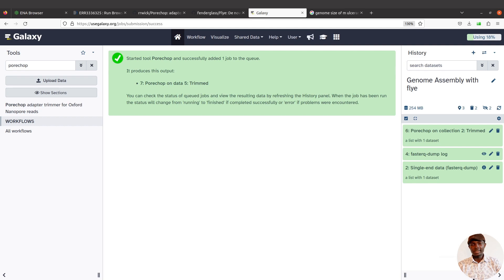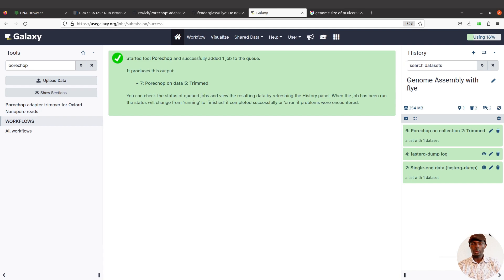Now ideally, you should have performed quality control on the raw data before processing to assess the quality. If you have your own data, I advise doing quality control first. After removing adapters, you can also filter reads — for example, remove reads shorter than a particular threshold, or filter based on quality. You can then compare the processed reads against the raw reads to decide which is appropriate for downstream analysis. For this tutorial, the focus is on using Flye, so I will skip those steps.